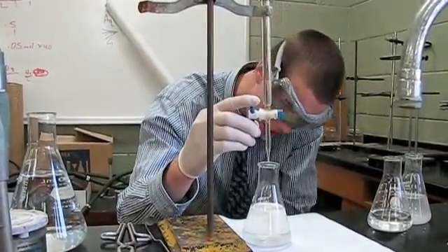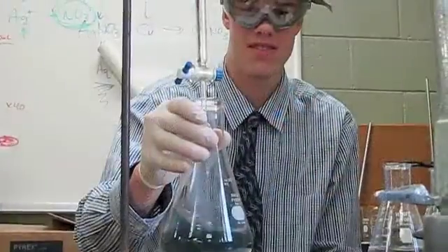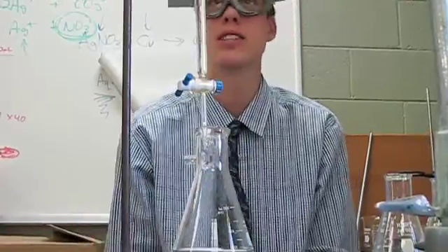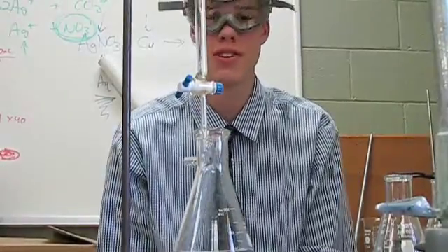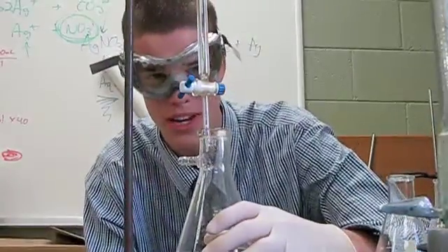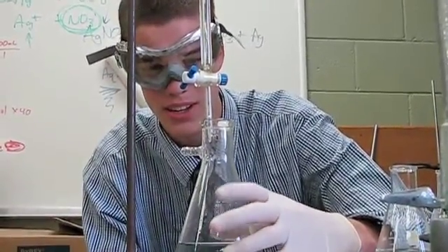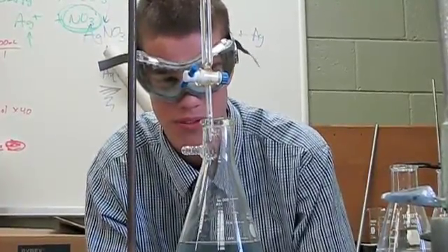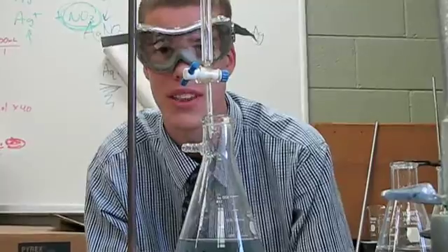It's kind of going yellow. At this point we can measure how much potassium iodate it took for us to bring out the blue color and counteract our base of vitamin C. So through a bunch of mole ratios and concentrations and stuff, we can figure out how much vitamin C was really in the tablet.